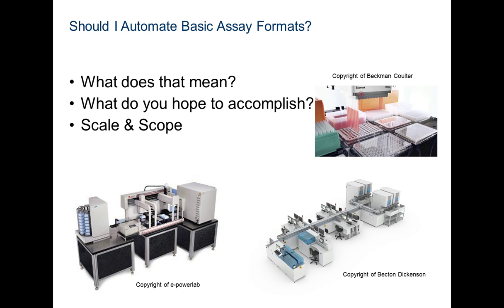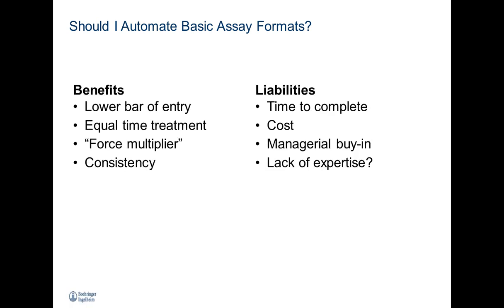How big do you want it, and what do you want it to do? There are some benefits and some takeaways to automating basic assay formats such as ELISA. With an ELISA, there is a lower bar of entry.